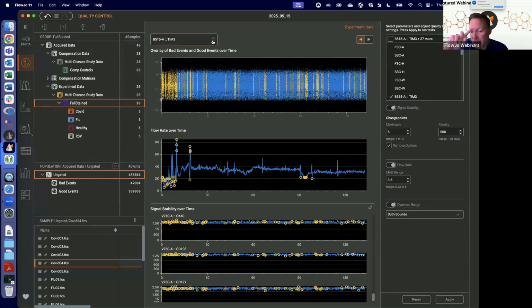All right, so Mitch had a question. Serena hit it. Yeah. So QC's been in for a little bit. Worries about the beta version are going to end in about 2 weeks when this is the released version.